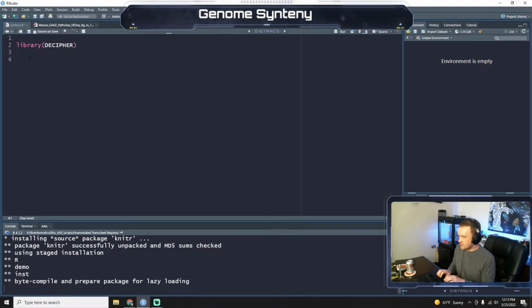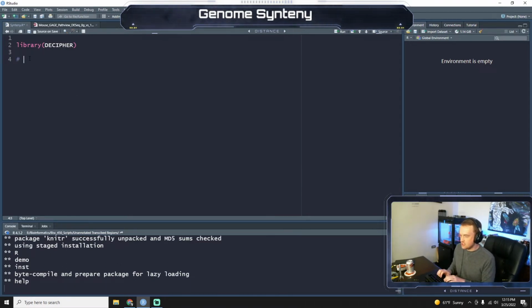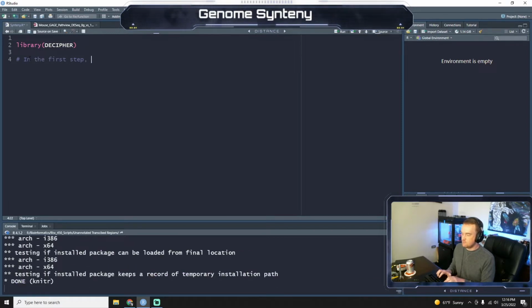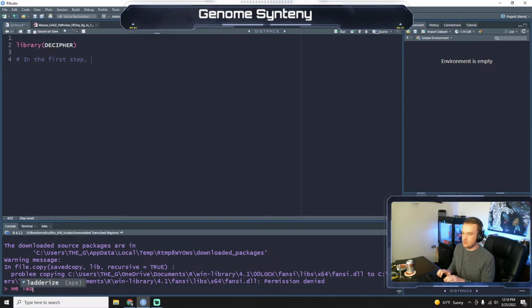Okay, while that's going, so in the first step, we load the libraries and the sequence into longSeqs.